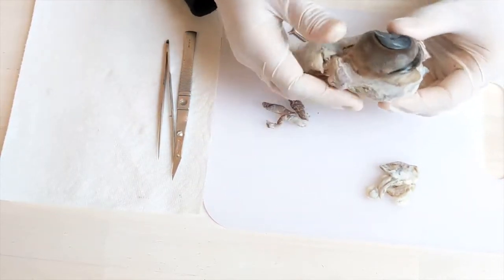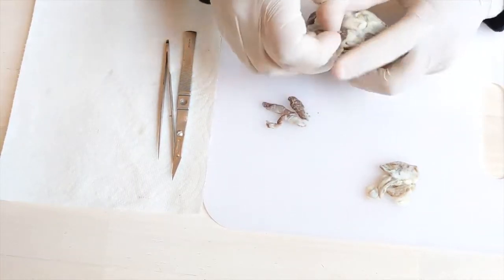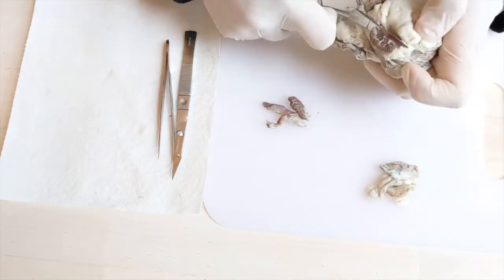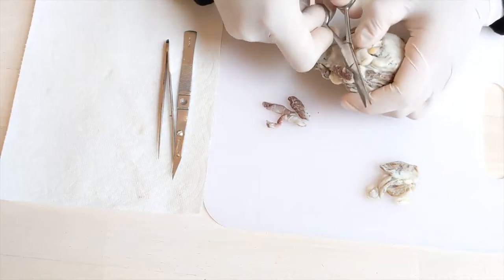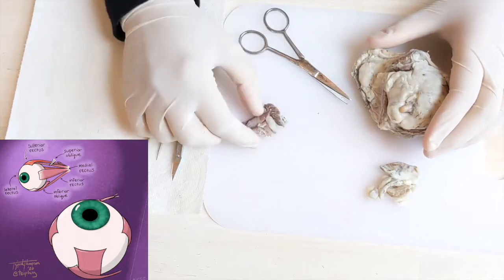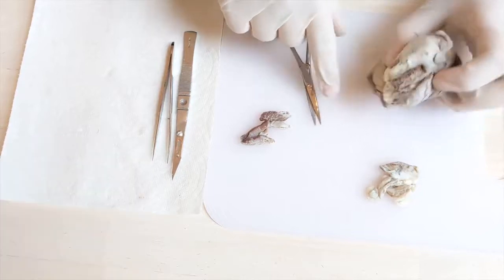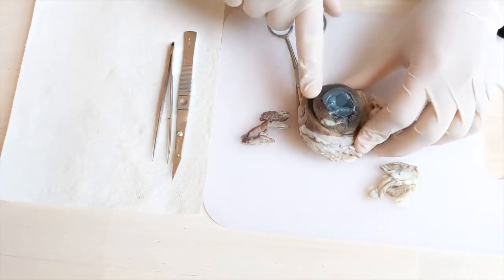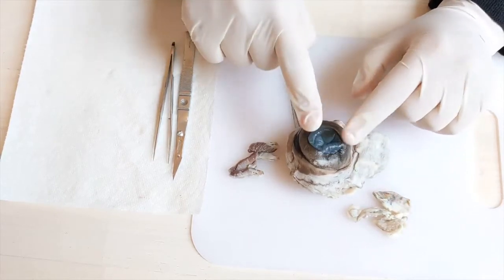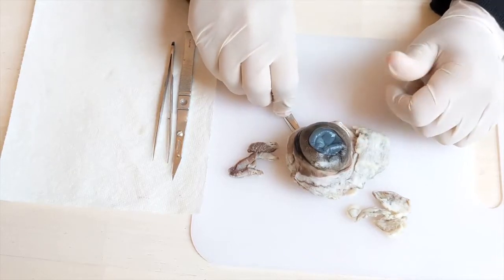The cow eye has 4 muscles, so it can move in 4 different directions: up, down, right, and left. But us humans, we have 6 muscles. Besides the 4 directions, we also move our eyes clockwise and counterclockwise. So this is one difference between a cow eye and a human eye: we are able to move our eyes in 6 directions, but the cow eye can move its eye in 4 directions. Perfect.